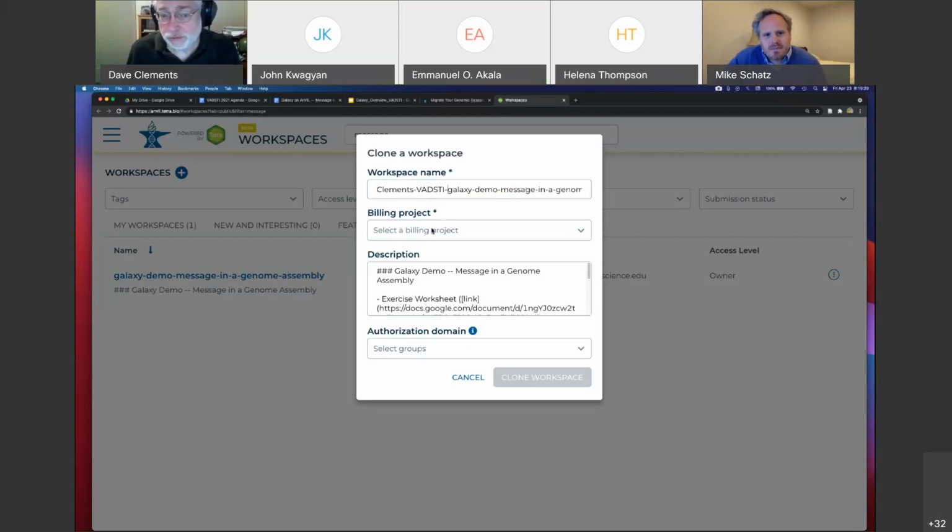Now, for all of you, Anvil's brand new, so you're not going to have collision problems, but you can't have 3 people in the same billing project create exactly the same workspace name. You all have to have unique names. So putting your name on the front is not a bad idea in general.